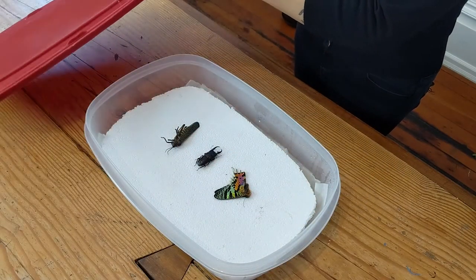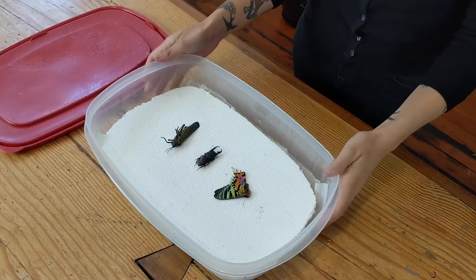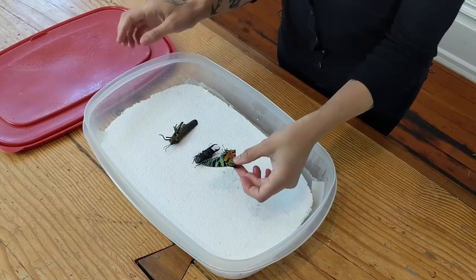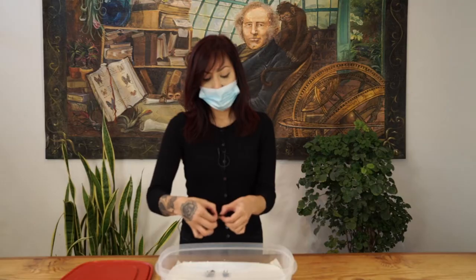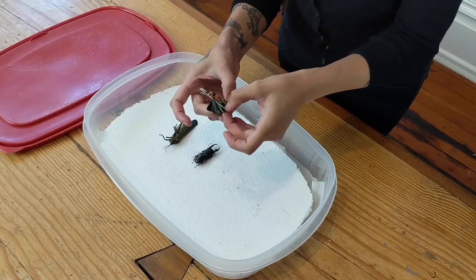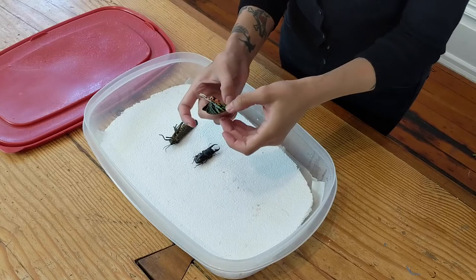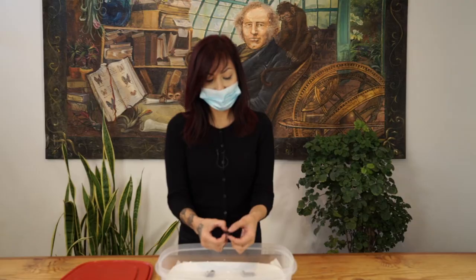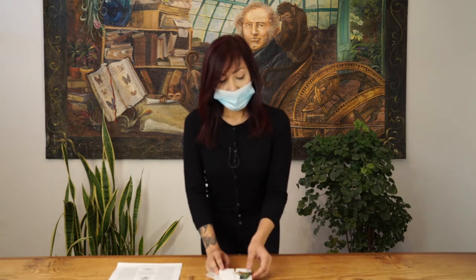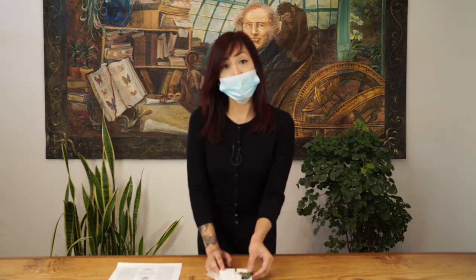Now that your insects have been left alone in their container for up to three to four days, you're going to want to check on them by carefully picking them up and seeing if their legs and or wings are flexible. A good indication is that you won't feel any resistance from the wings or legs. So now that we have checked on our insects to see if they have been rehydrated enough, we can finally move on to pinning and spreading one.